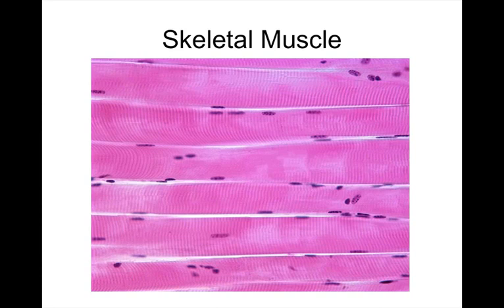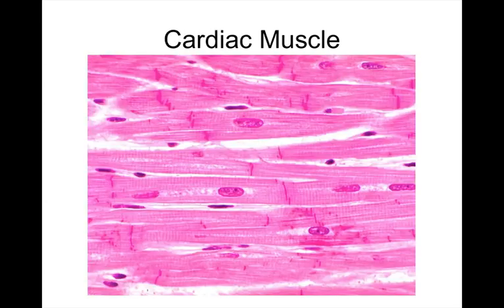Good question. It's because skeletal muscle, we usually call these skeletal muscle fibers for the reason that they are fusions of multiple cells. So these individual muscle fibers can be really long, they can go the whole length of your thigh muscles, so we're looking at a foot for some people. So in this case, we're looking at actual fusions of smaller cells that organize so that you can have these really distinctive railroad track kind of appearances, barrel-shaped cells, fibers. I'll get into fibers versus cells later on.